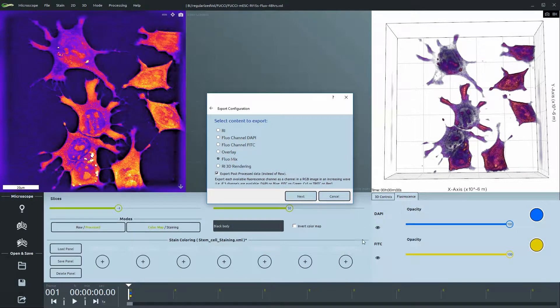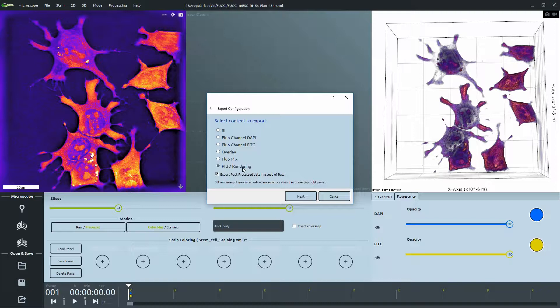Phleomix exports fluorescent channels as corresponding RGB values. And the refractive index 3D rendering exports what is visualized in the 3D view on the right.